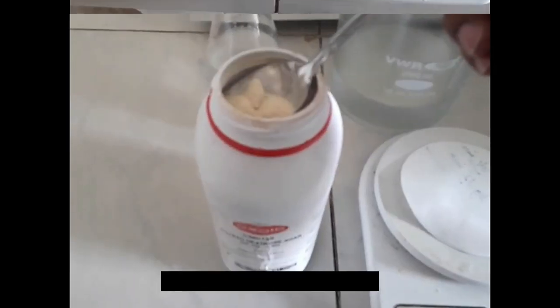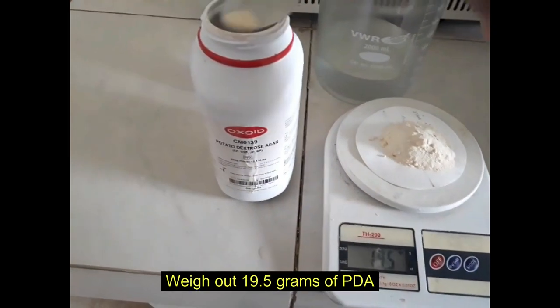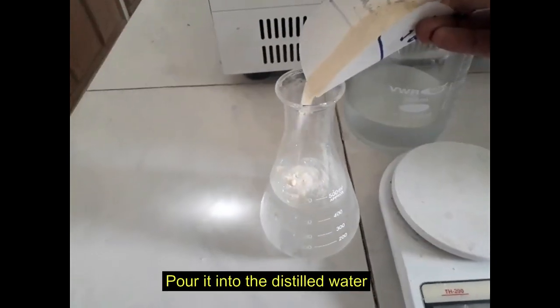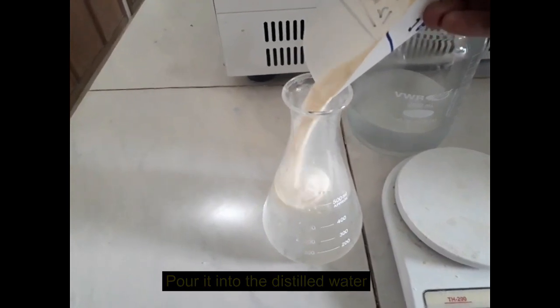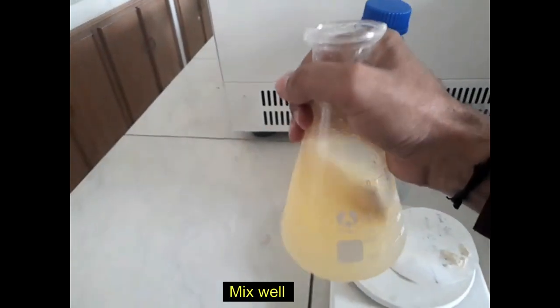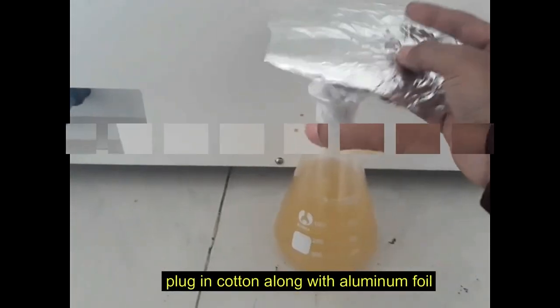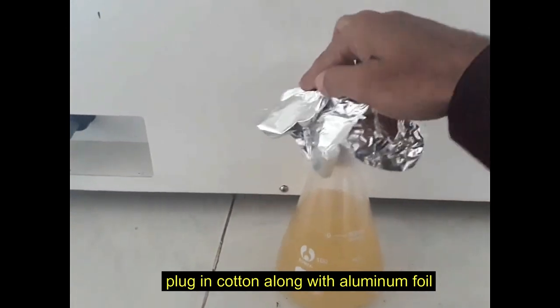Weigh out 19.5 grams of powder PDA and mix it with the distilled water. Mix the solution thoroughly. Plug in the non-absorbent cotton along with aluminum foil.